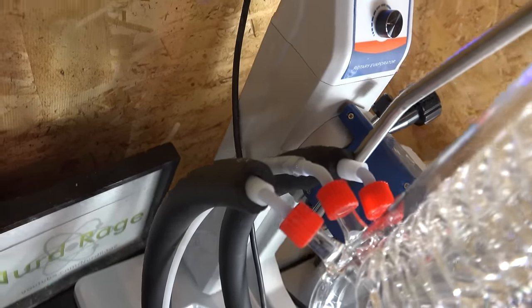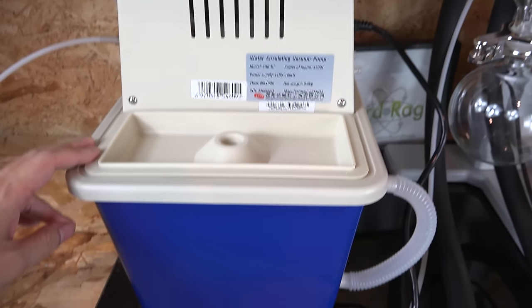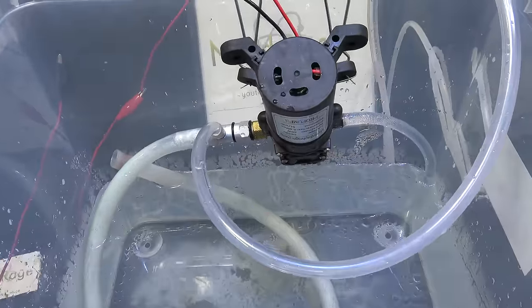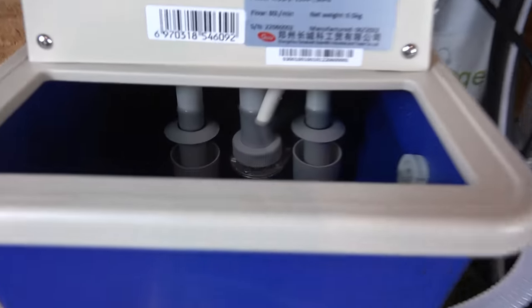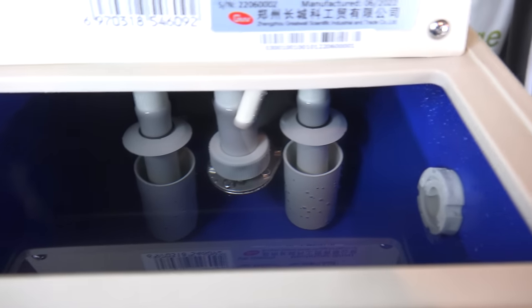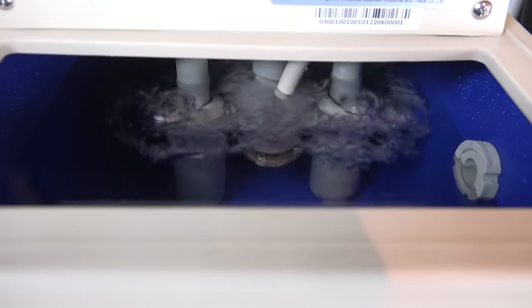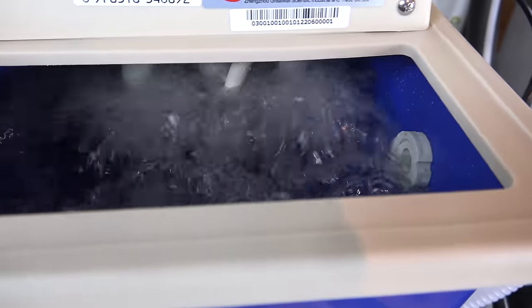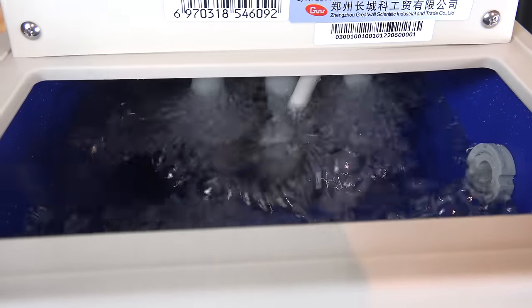The vacuum line is connected to this vacuum pump. This pump is just a high-powered professional version of the aspirator pump I showed in a previous video — the water reservoir is for the pump's working fluid. These pumps are advantageous over more common rotary vane and scroll pumps because they are much more chemically resistant, so even in a professional machine like this they have their uses.